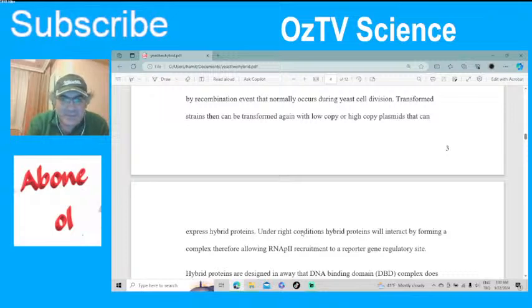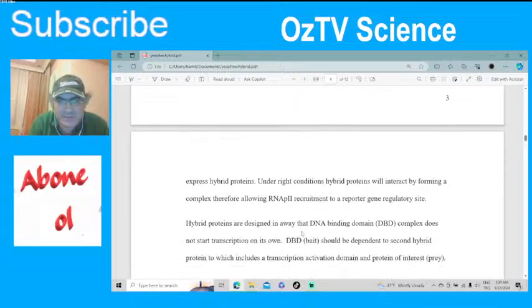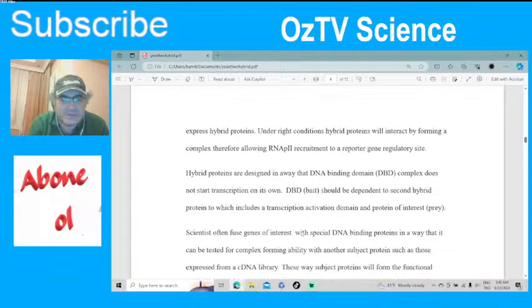So if you can get these plasmids to express these hybrid proteins, you can do experiments. Under the right conditions, hybrid proteins will interact by forming a complex, therefore allowing RNA polymerase to the reporter gene, which gives you a color or some sign.